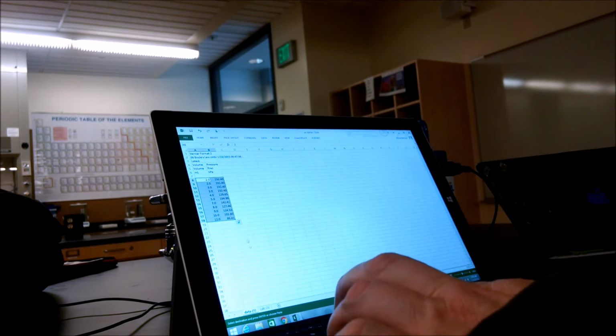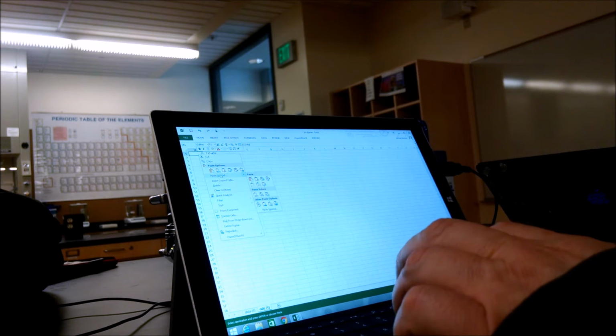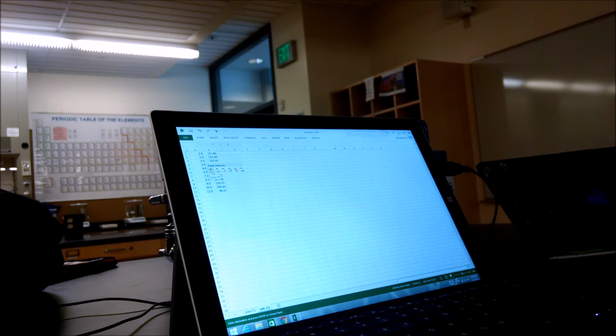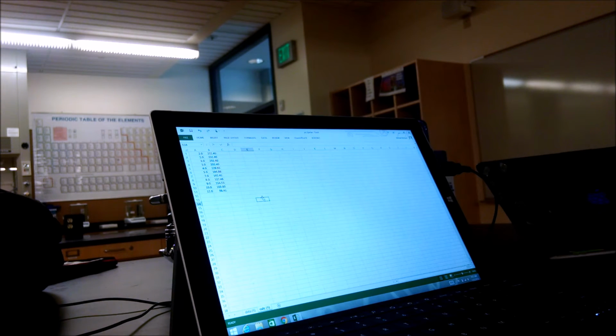So I'm going to copy that, and then I'm going to go here and do paste special, format. Where's format? So paste, values, formulas, transpose, formatting. Okay, so now the formatting's up to date. I hate this little control thing that comes up. Okay, so now what's next?